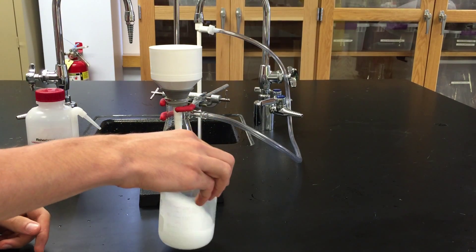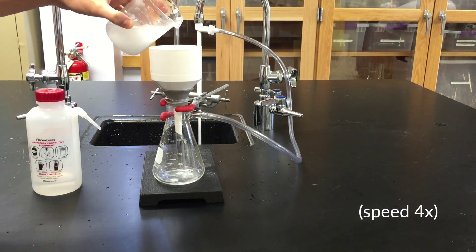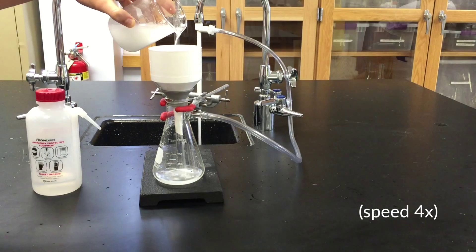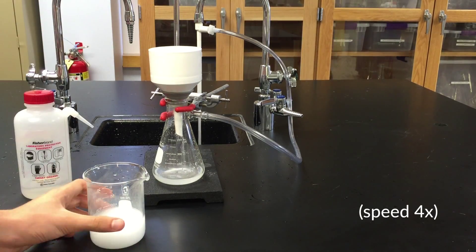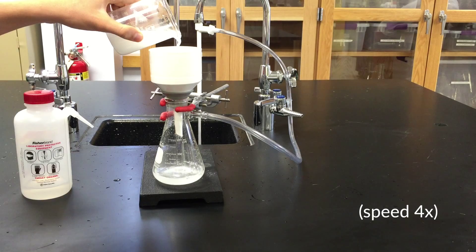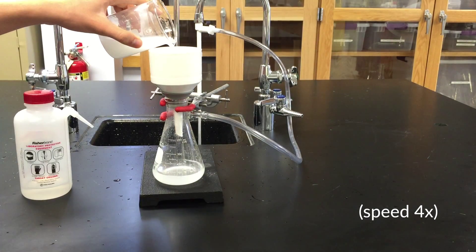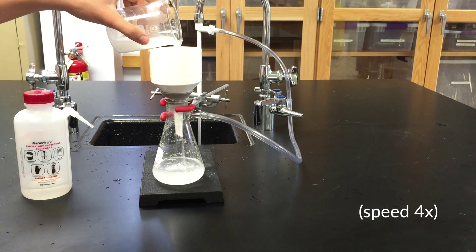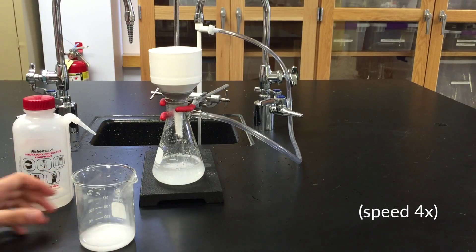Now take your solution from which you want to filter out the precipitate and slowly pour it into the center of the filter paper. Don't go too fast or some of the precipitate might get into the flask. Depending on the strength of the water flow, the suction from the faucet might be more or less. As a result, the filtrate can sometimes be murky and you might have to run it through the filter again.